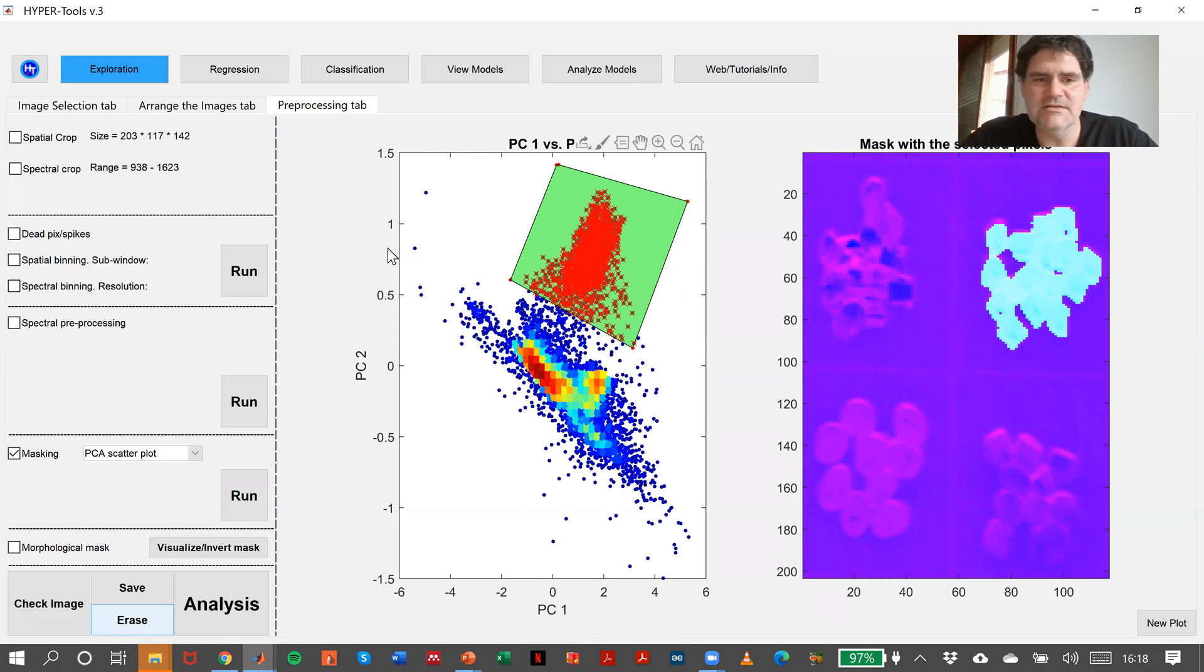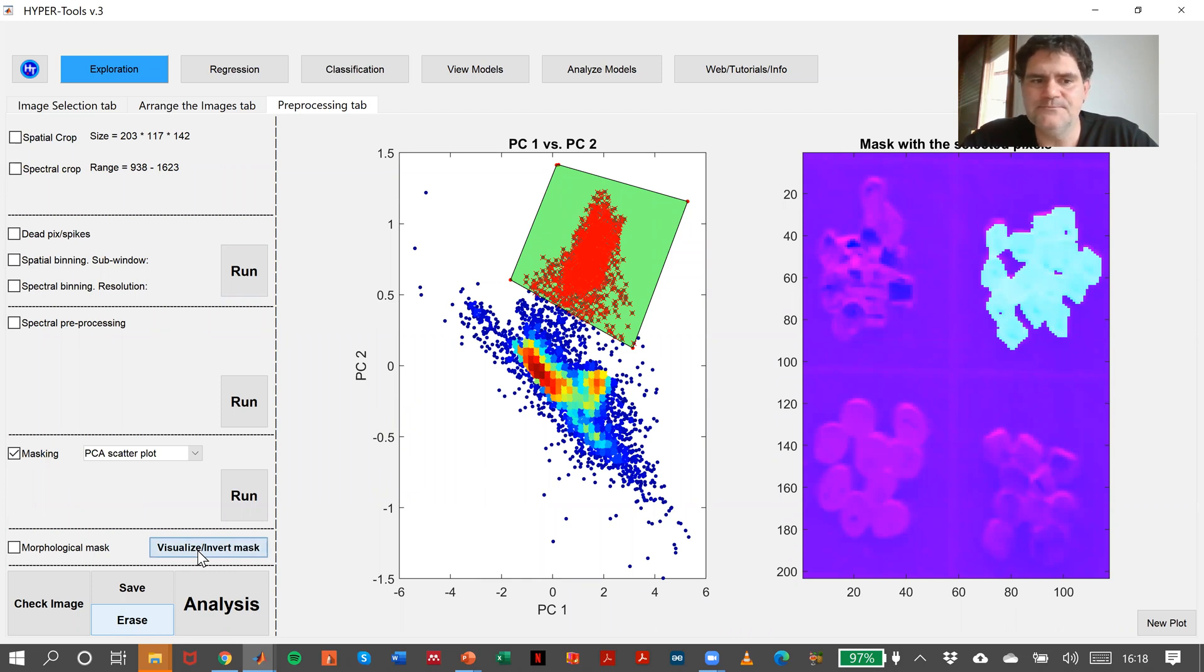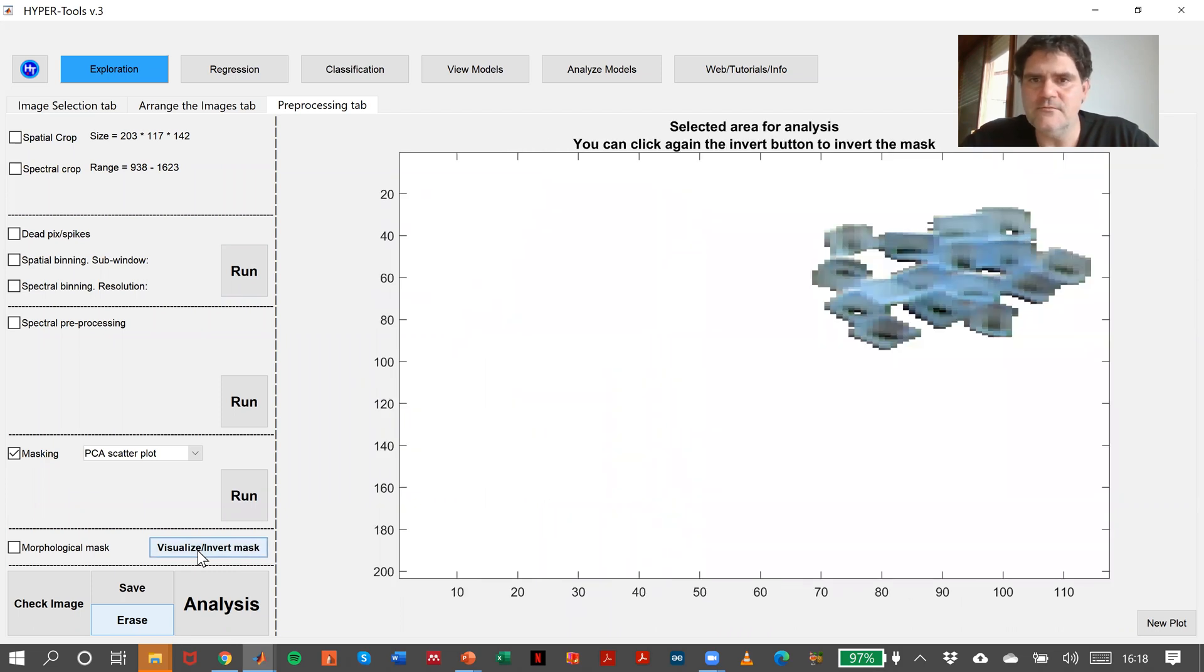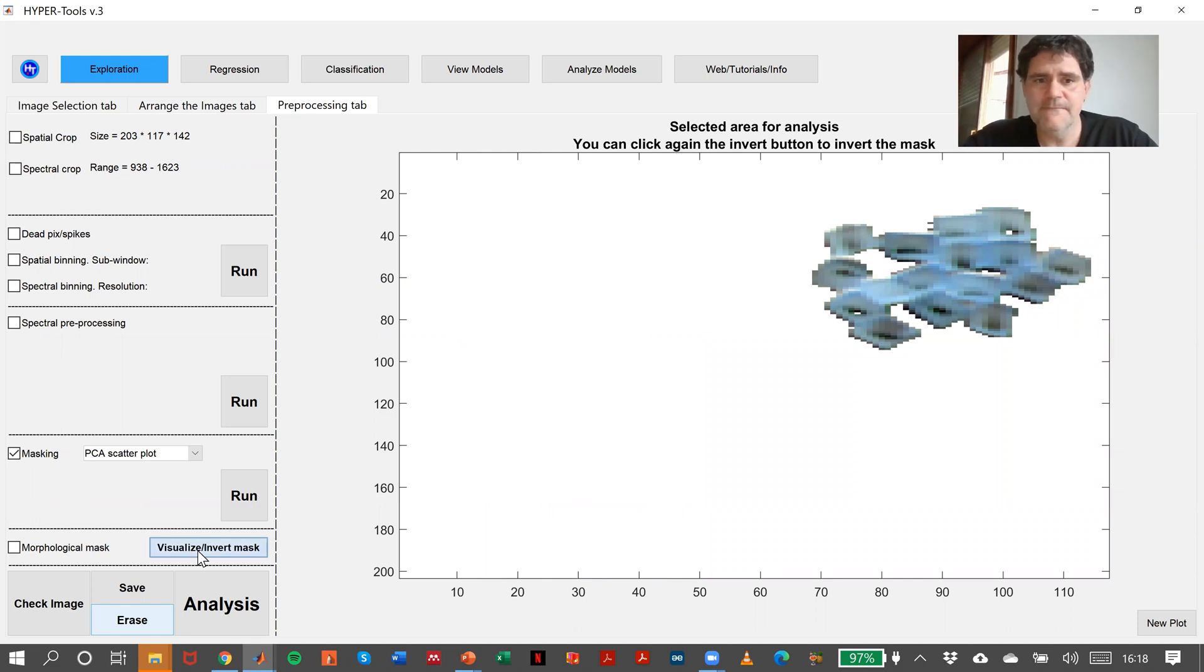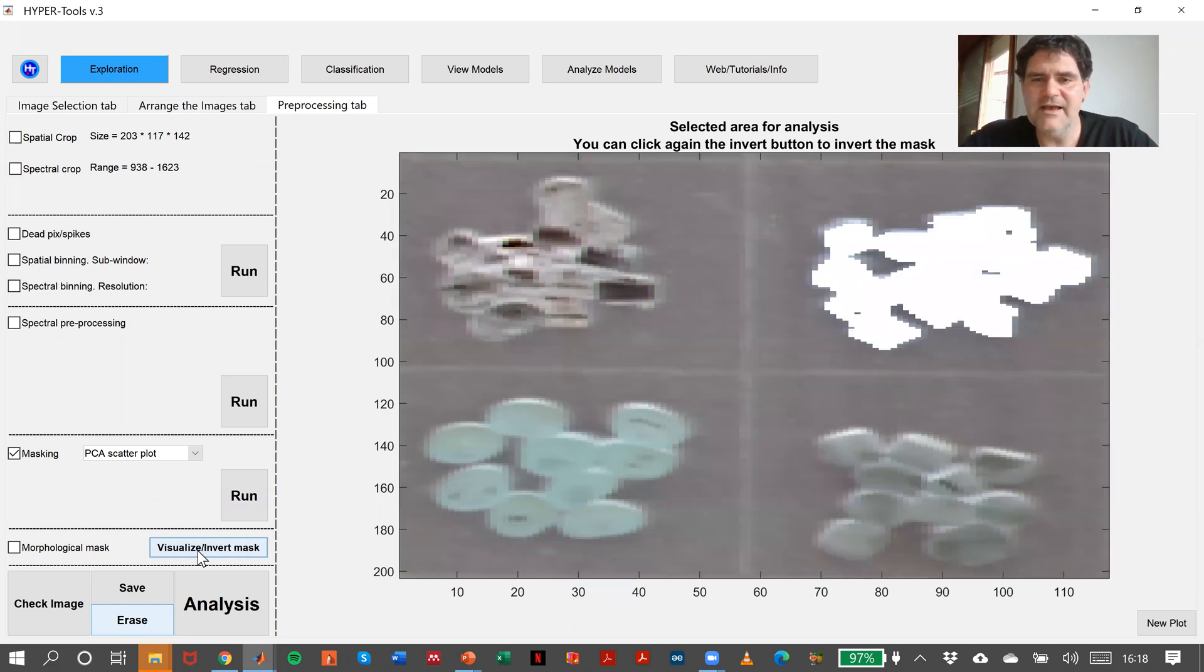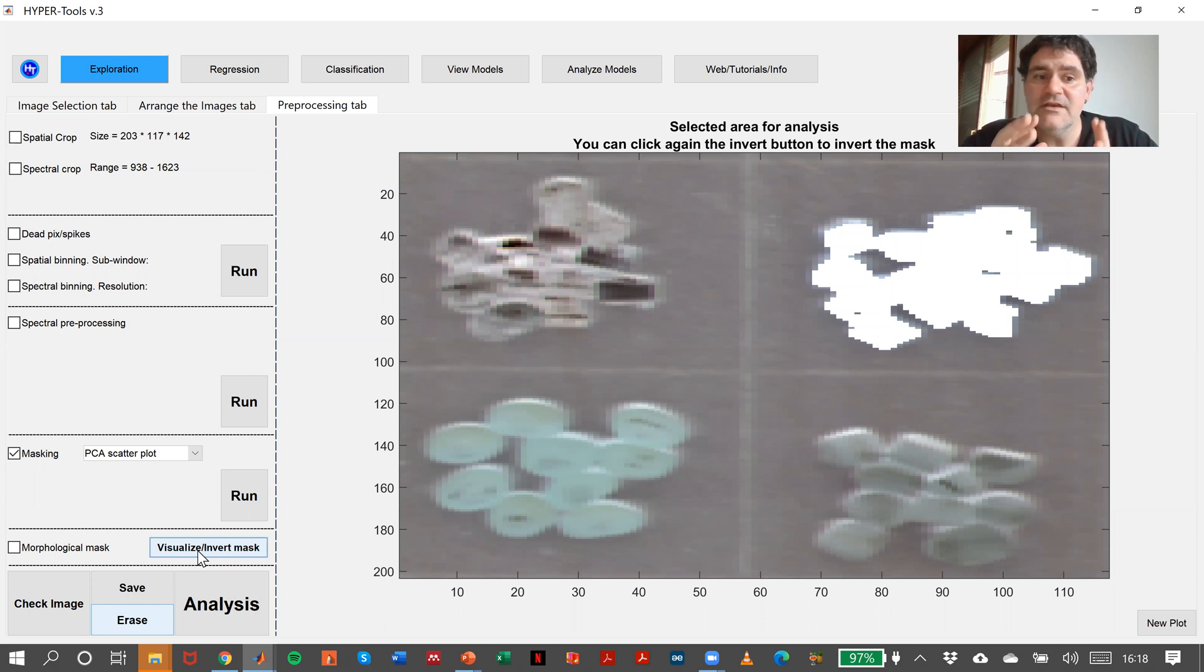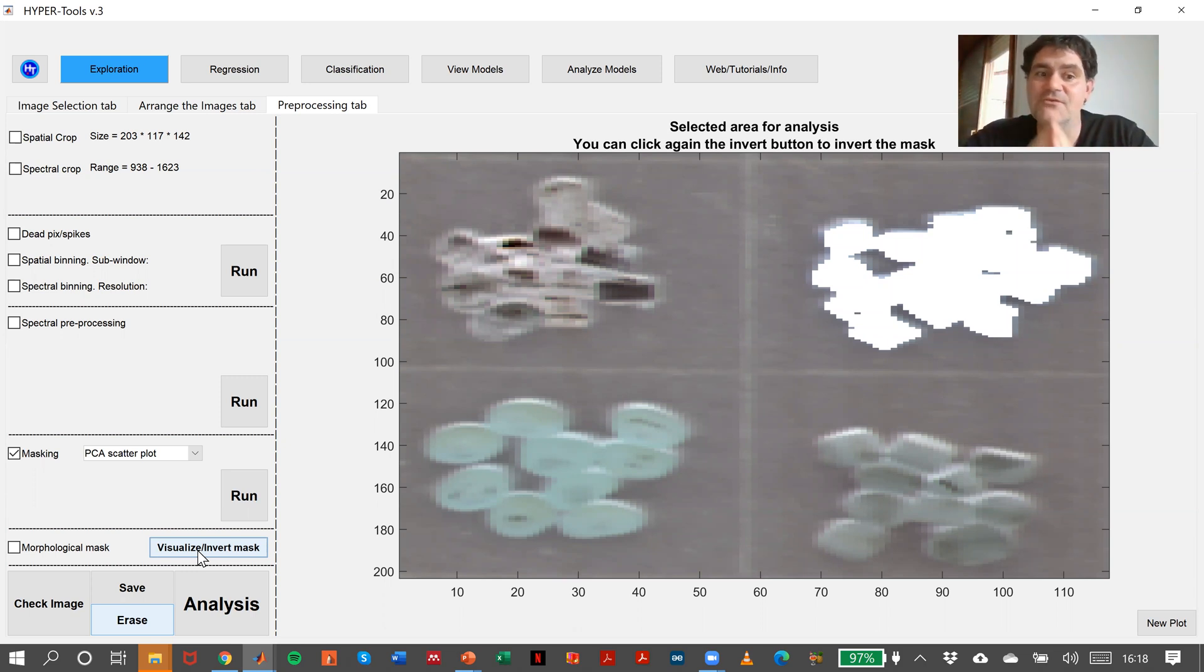In any case, we can click here, Visualize Invert Mask. So this is the part we have chosen. And if I click again, this is the part we haven't chosen, but this is the part that we are going to actually analyze if we don't say otherwise.